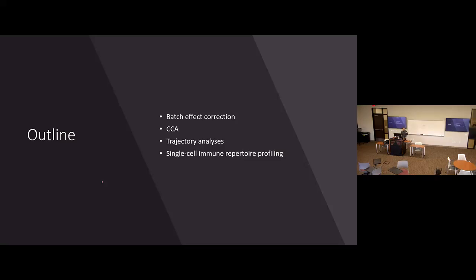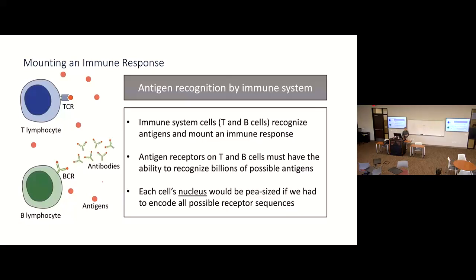We still have 30 minutes. I will finish off with the single cell immune repertoire analysis. I don't know how many of you will have a chance to use this, but it's a very, very important, very powerful approach for immune cell analysis in immunity study.